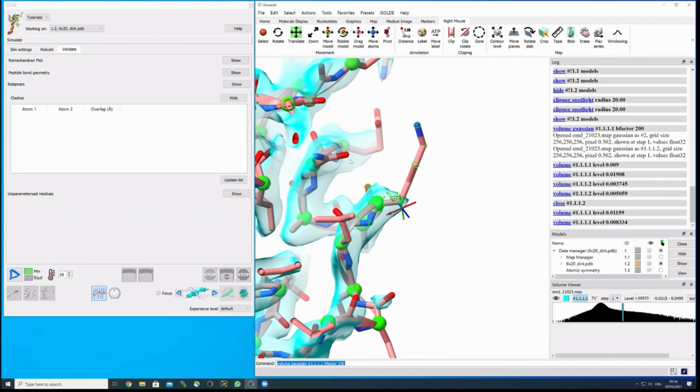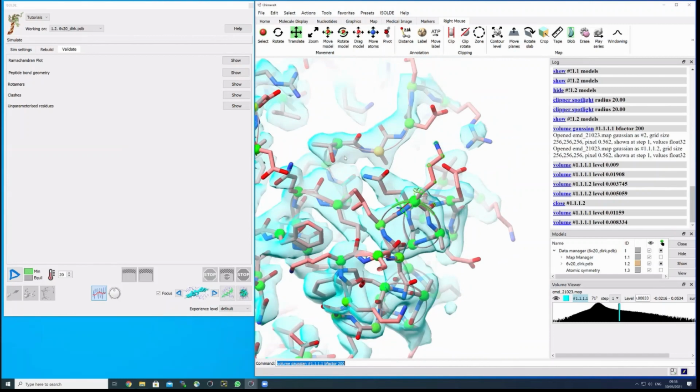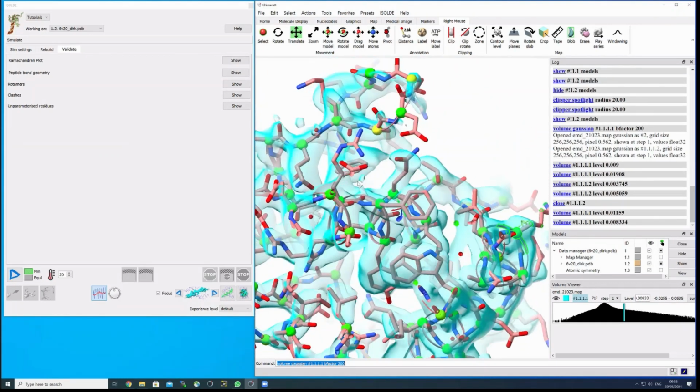However, if you're using other software tools, such as Coot, you can easily model two residues in the very same location in space and generate a massive clash. In such cases, you would basically end up with a list here with the atoms that are actually clashing and the overlap of these atoms. And these are the three metrics I wanted to show you, which we can fix when we're dealing with Isolde and when we do model building.